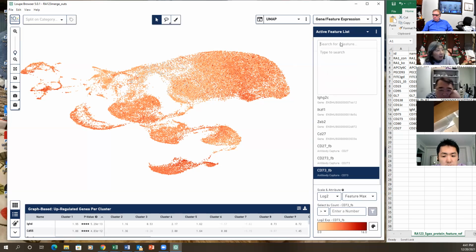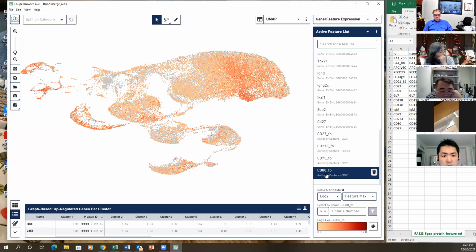Let's say CD80. CD80 is not good either. Well, they all have this here and then here. I don't know about that one, but a little bit here, right? They all cut down through this, and then they hit that little population of CD27. Some of them wander over.